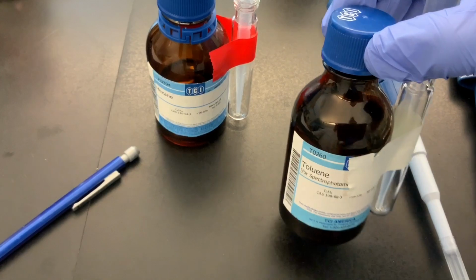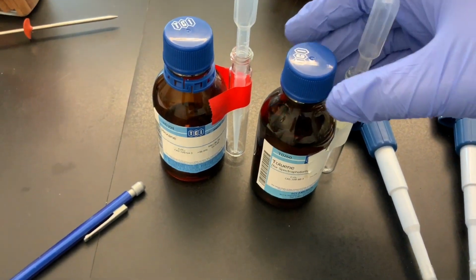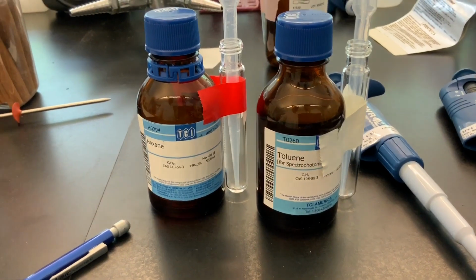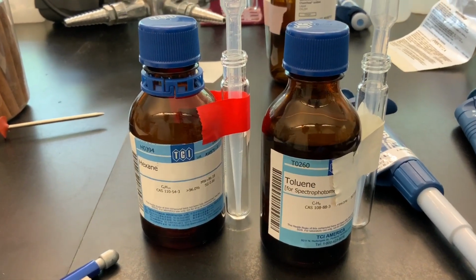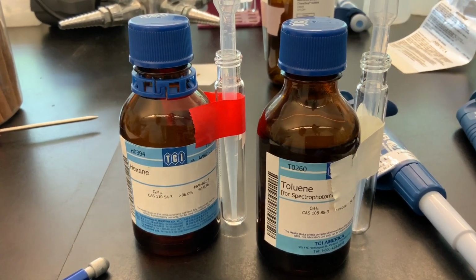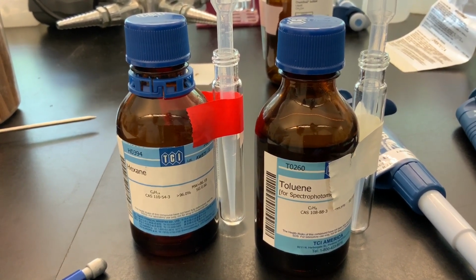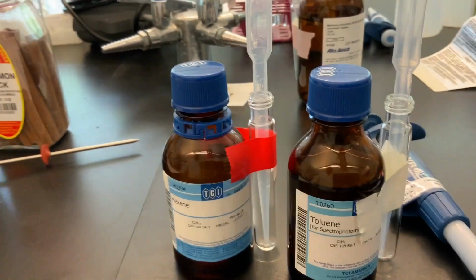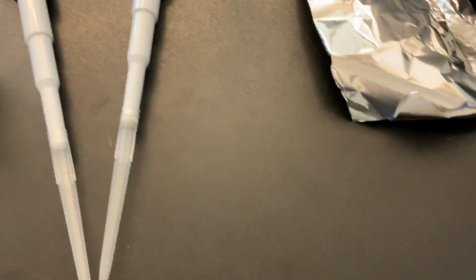These are very high grade solvents from TCI, and we're going to distill 1 milliliter of each.